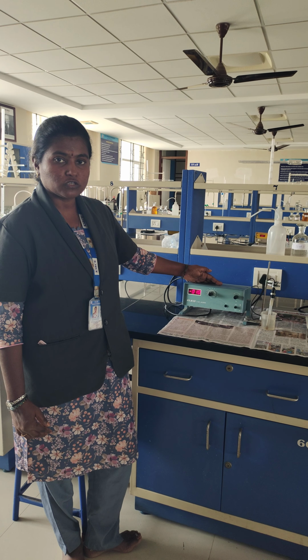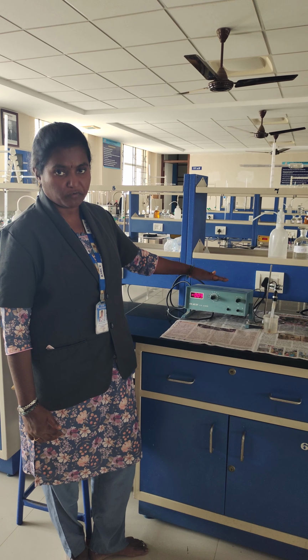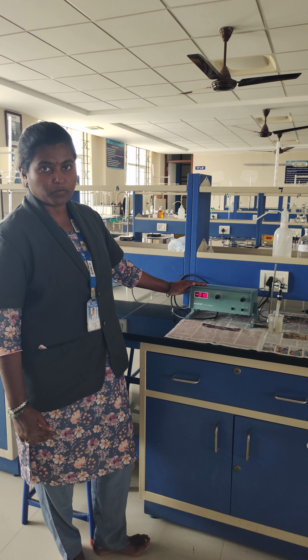It is also used in the medical field, especially the pH level of blood can be measured by advanced potentiometric pH meters. So this is the basic model for pH metry.